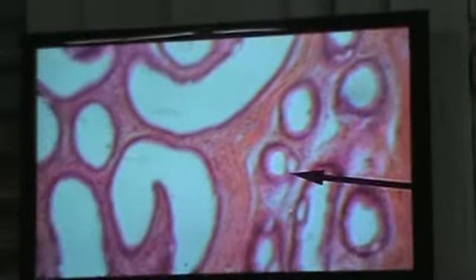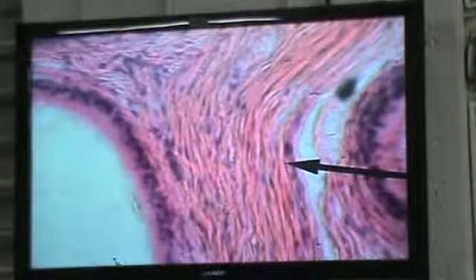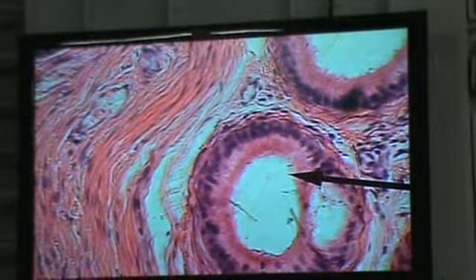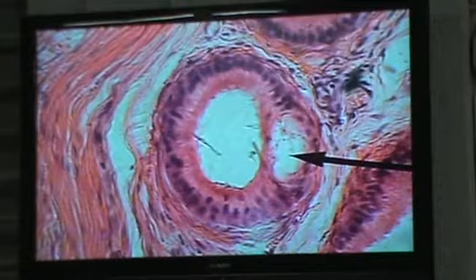Okay, this is the one here. Okay, let's look at this again. Alright, yeah. So, one of the small little guys, but still I'll find some good ductuli efferentes for you. Let's do that for a while. We're going to come back to that. Let's look at the duct of the epididymis.